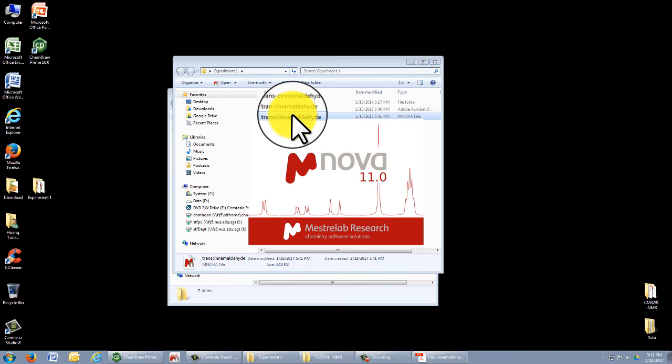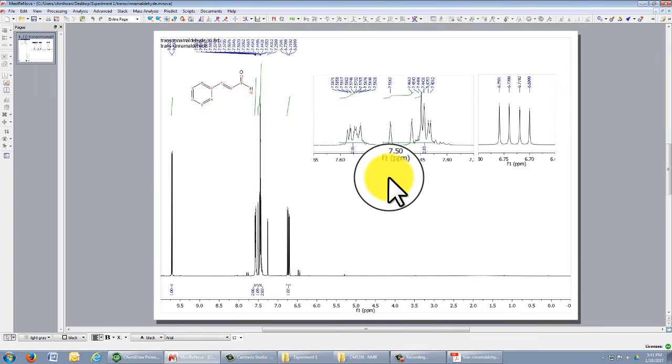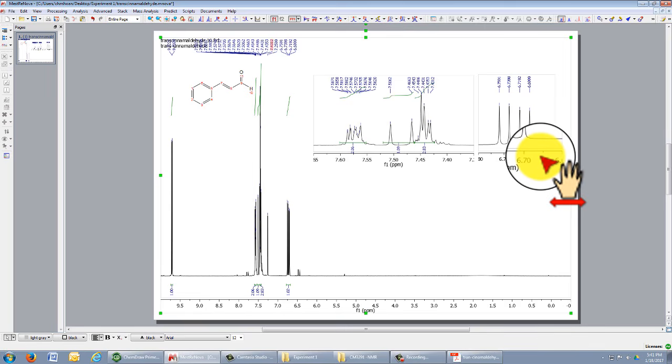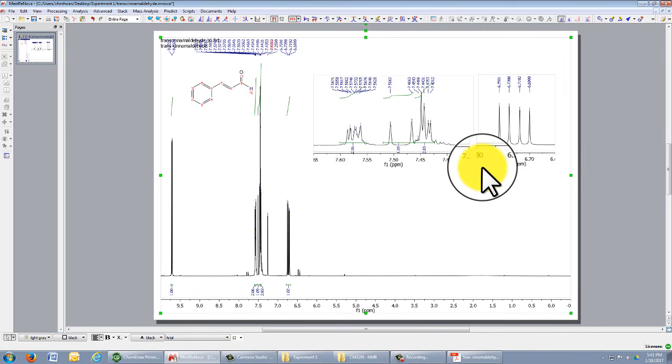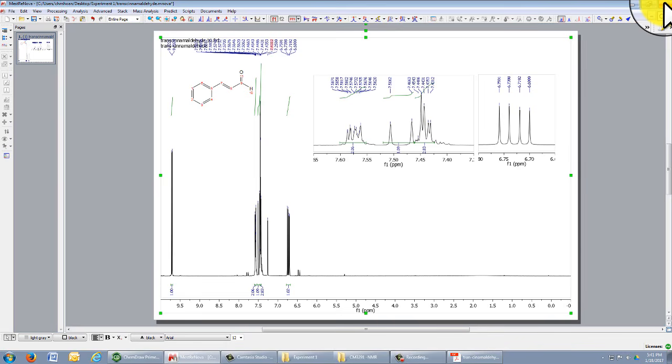In terms of the numbers, you only change decimal places of the chemical shift. You can come back again to do more analysis and export again as a PDF. It's really up to you. You can even change the color of the fonts, the spectrum. You can feel free to play around with this. Okay? Just try to impress us if you wish to. Follow this guideline and I hope that you can practice more and do well.